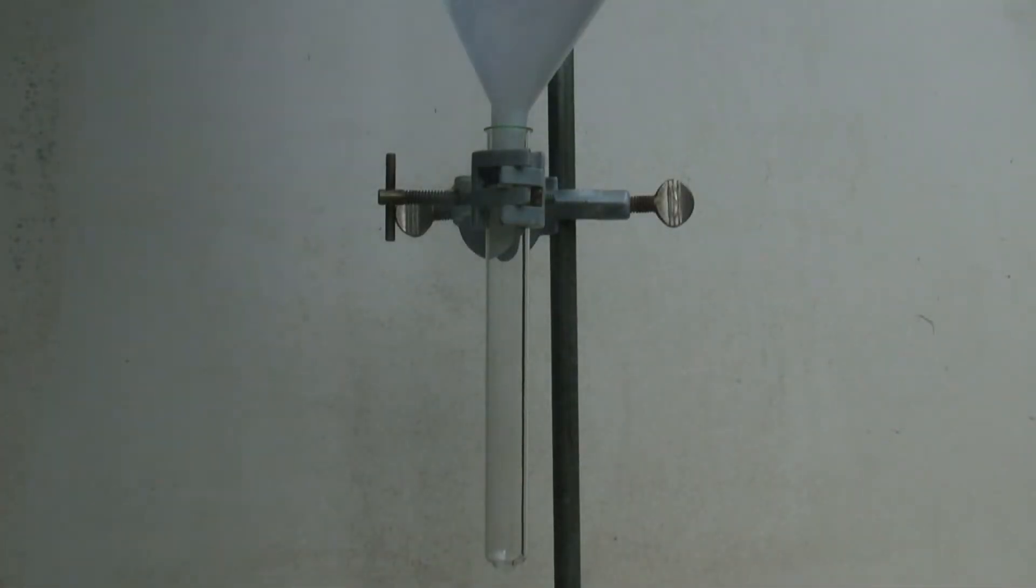The mixture is then added to a test tube which is attached to a ring stand. On top of the mixture a layer of sand is added. Then the tube is tilted.